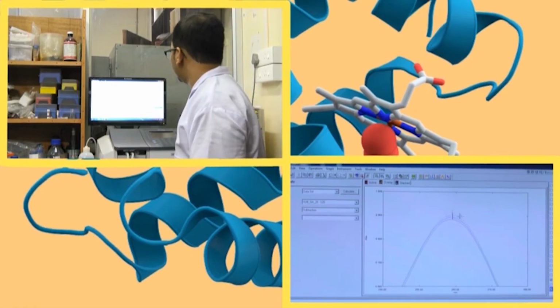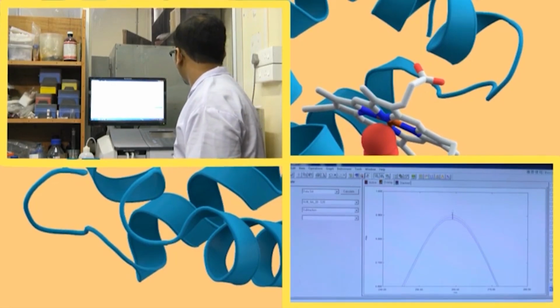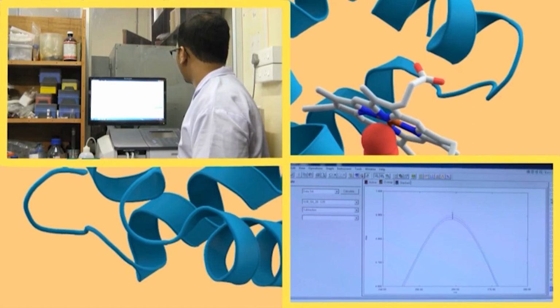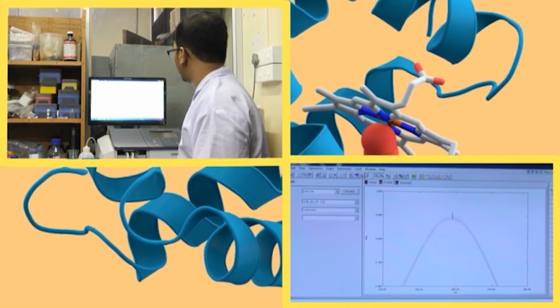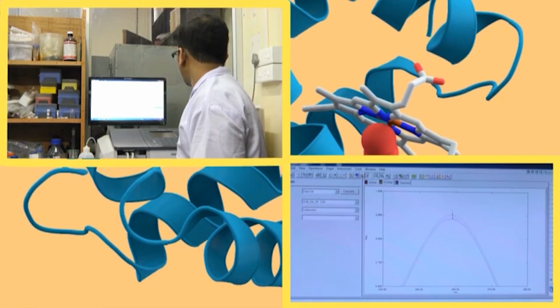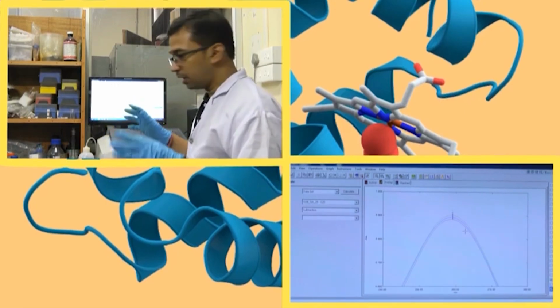So, here we can see there is not a major change in the intensity, but this one where it is gone, gallic acid only. So, this is the green line where you can see the gallic acid only. The green line appearing and disappearing, this is for only gallic acid without HSA. Now, when I am giving this 10 microliter of HSA and 20 microliter of HSA, you can see here 10 microliter, 20 microliter HSA. So, it is decreasing in the first two cases.